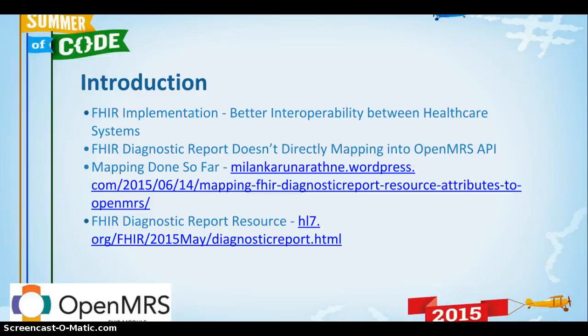So, what is FHIR? Currently, OpenMRS is implementing support for FHIR, which is a standard protocol that enables better interoperability between healthcare systems. FHIR defines some resources, and data between healthcare systems will be exported and imported using those resources. The FHIR diagnostic report is one of them.